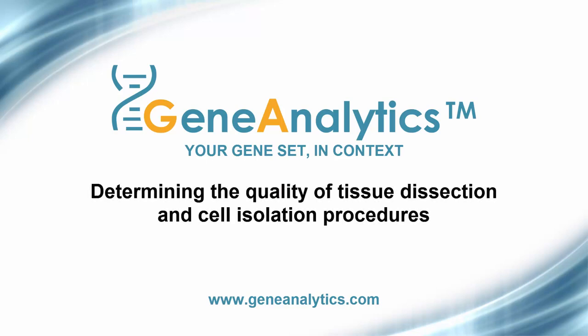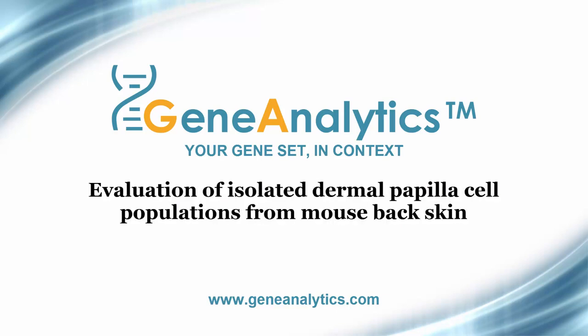In this demonstration, we will show how Gene Analytics can be used to determine the quality of tissue dissection and cell isolation procedures. We will take as an example the isolation procedure of two dermal papilla cell populations from mouse back skin, which was published in the journal Development in 2009.